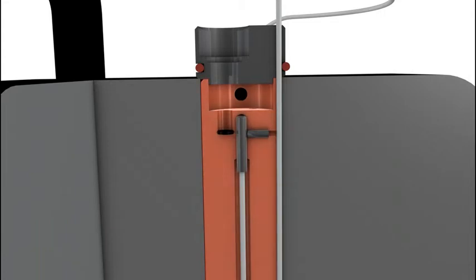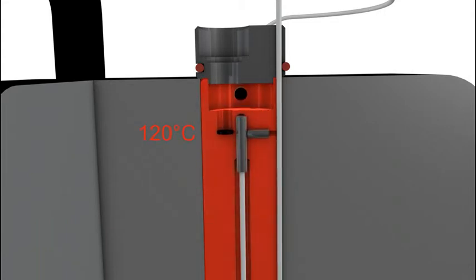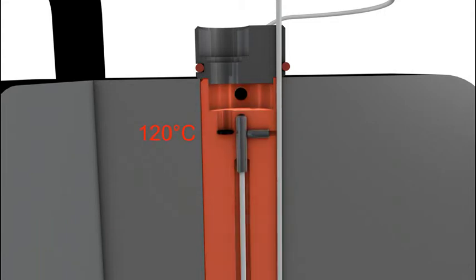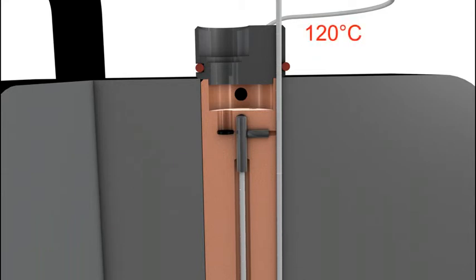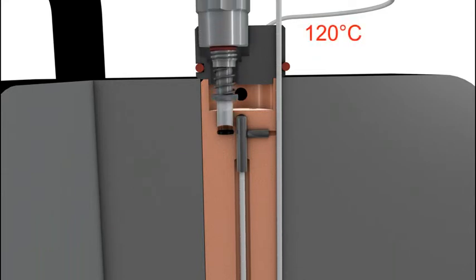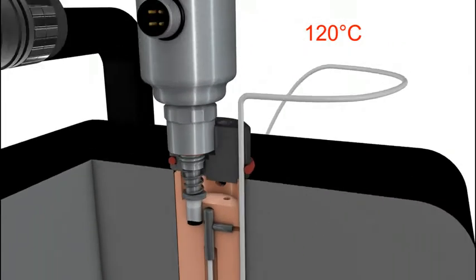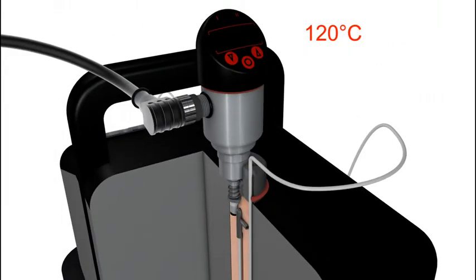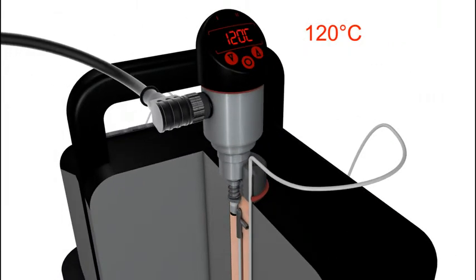We recommend that a reference sensor be mounted in the calibrator close to the clamp-on temperature sensor being calibrated. As you can see here the reference sensor indicates 120 degrees Celsius. The sensor being calibrated is placed in the customized insert. After an adaption period the accuracy of the clamp-on temperature sensor can be assessed by comparing it with the reference sensor. It is then adjusted if necessary.